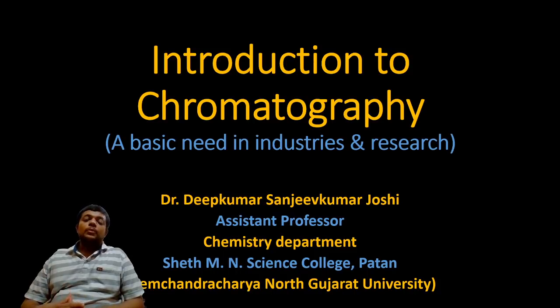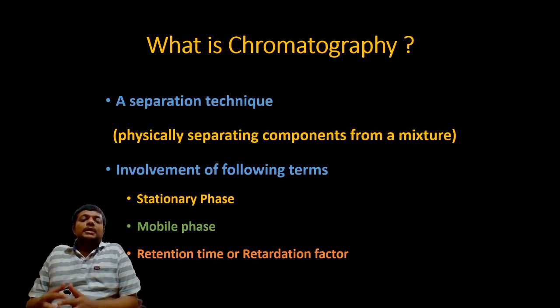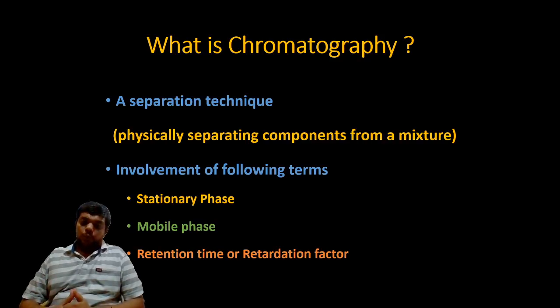Friends, the basic motive behind making you aware of chromatography is that nowadays it has become a basic need in every industry as well as in every area of research. Whenever we discuss the word chromatography, we always coin it as a separation technique. But mind well, it is a physical separation technique. So, we can write it as physically separating components from a mixture.